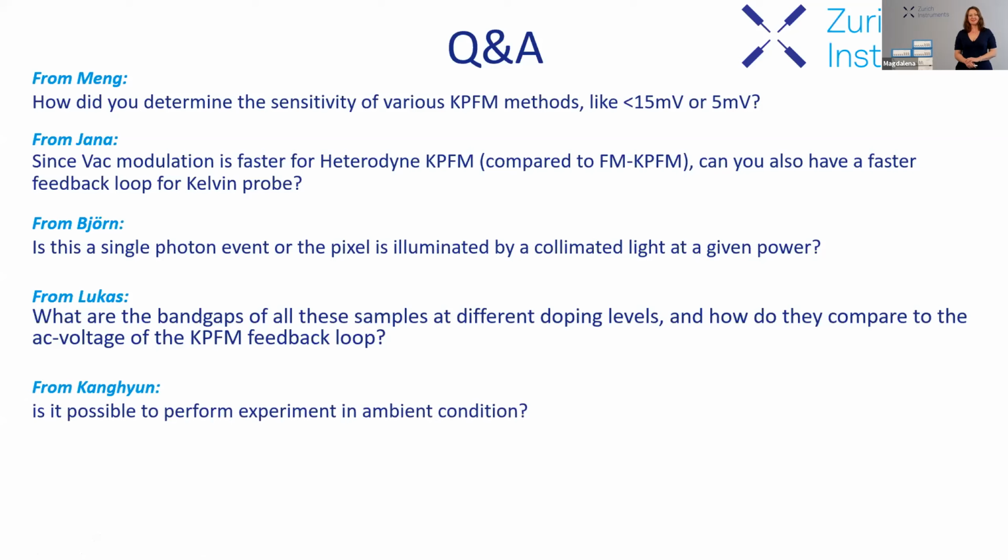And do we have another one? Yes. Is it possible to perform experiment in ambient condition? I would say that yes, but the main advantage to perform such measurement under ultra high vacuum is that we can have, mainly for KPFM measurement, high quality factor, which means we can work with a low bias for the AC component, for example, and then limit some artifacts. And in our case, we are not limited by the contamination because we have a passivation layer. But for measurement with a highly reactive surface, it's also more preferable to perform such measurement under high vacuum in order to have more stability of the surface.